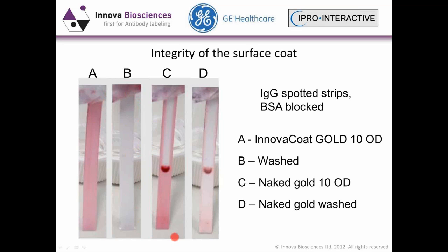And then we ran a naked gold at the same OD up that same strip, and you can see the binding to the protein IgG spot there very clearly. And even washing doesn't remove this aggregated gold particle from the strip.